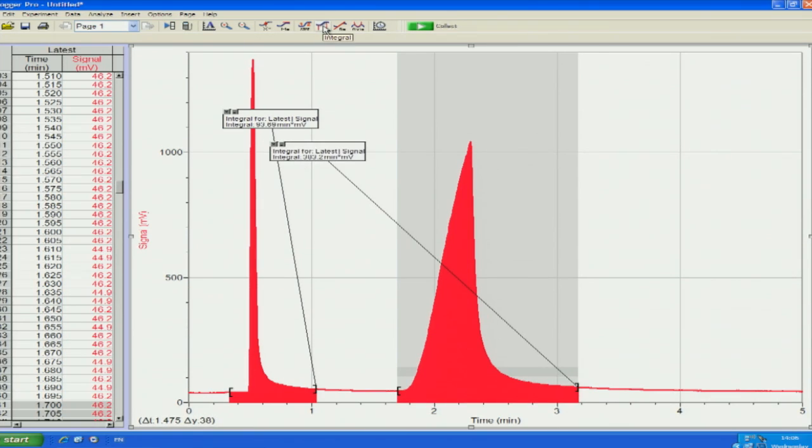At times, when you are interested in the quantitative aspects of your sample, that is, you might want to figure out a concentration, you will need to integrate the chromatogram. Here is how you do it.